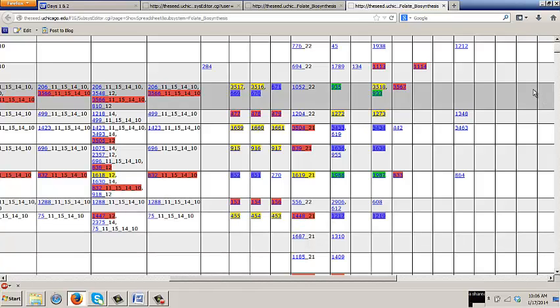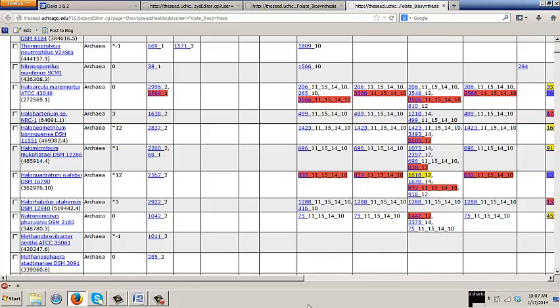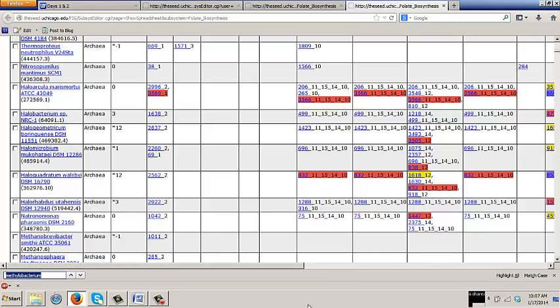It's really brilliant. And as you scroll down here, you can see that sometimes there's a lot of clustering in the folate pathway. It's good in that regard. It's quite typical to have 2 or 3 or 4 different clusters with one block of the pathway in one cluster, or probably operon, another branch of the pathway in another cluster, and so on.